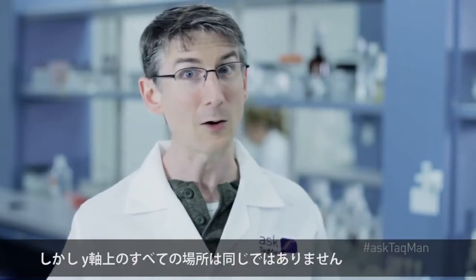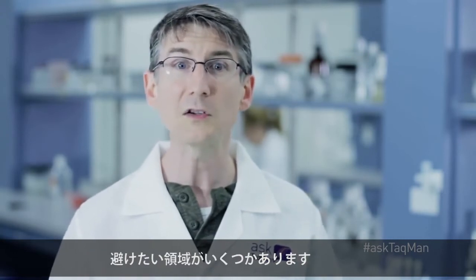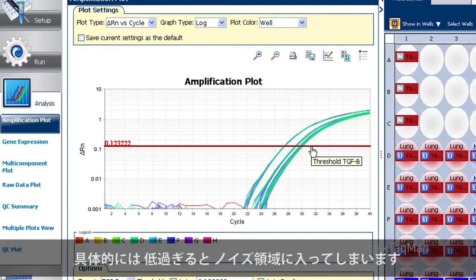Now, not all places on the y-axis are equal. Some regions we want to avoid. Specifically, we don't want to be too low, otherwise we get down into the noise.